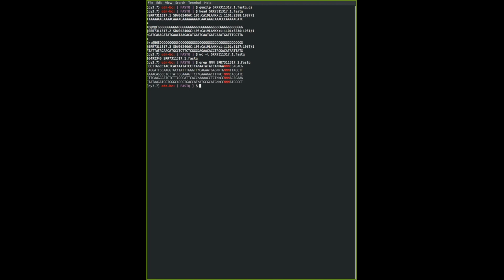Another shortcut, if you want to repeat the code that you have written previously, is to press the up arrow key. I'm going to press the up arrow key right now. You can see that the previous code appears in history, and I can repeat this and redirect the output into a file. Instead of putting it into the terminal, I can put it into a file by typing in this more-than sign followed by the name of the file. I think I'm going to put NNN. I think it's going to overwrite. It's fine, I guess. So it will save into this file called nn.txt, which you can see here.